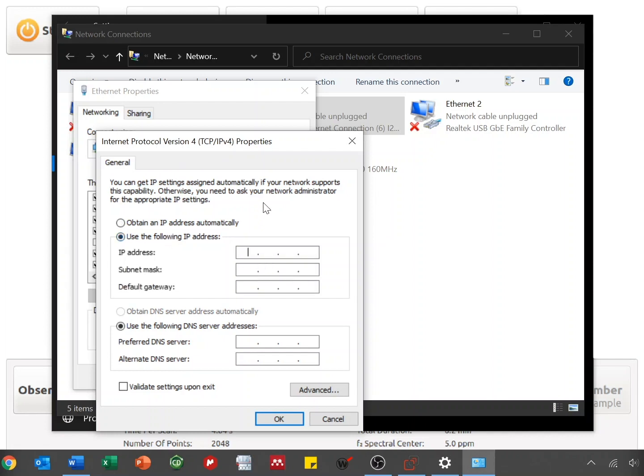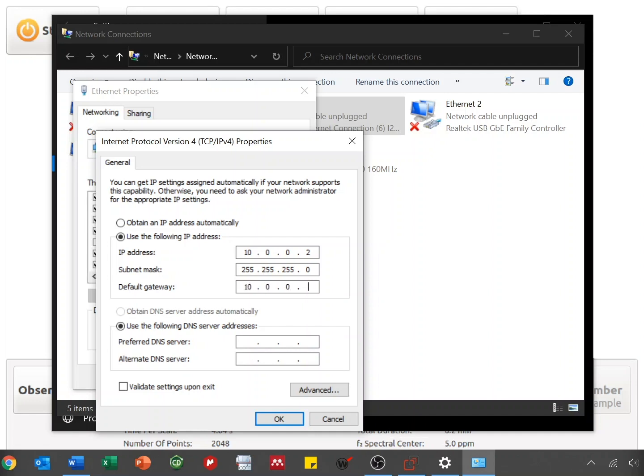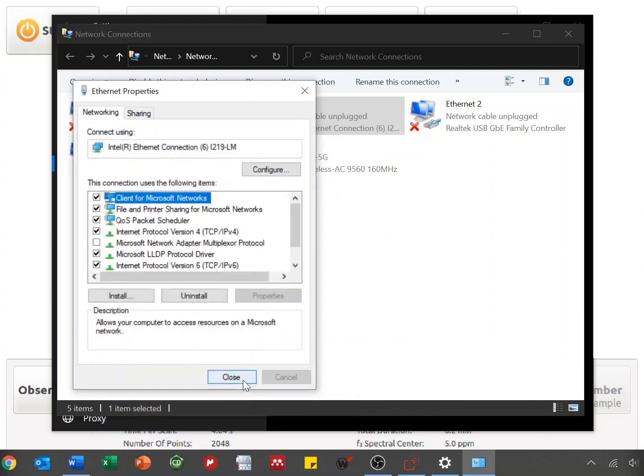And for IP address, we're going to enter 10.0.0.2. For the subnet mask, we'll enter 255.255.255.0. And for the default gateway, we're going to enter 10.0.0.1. Now press OK.